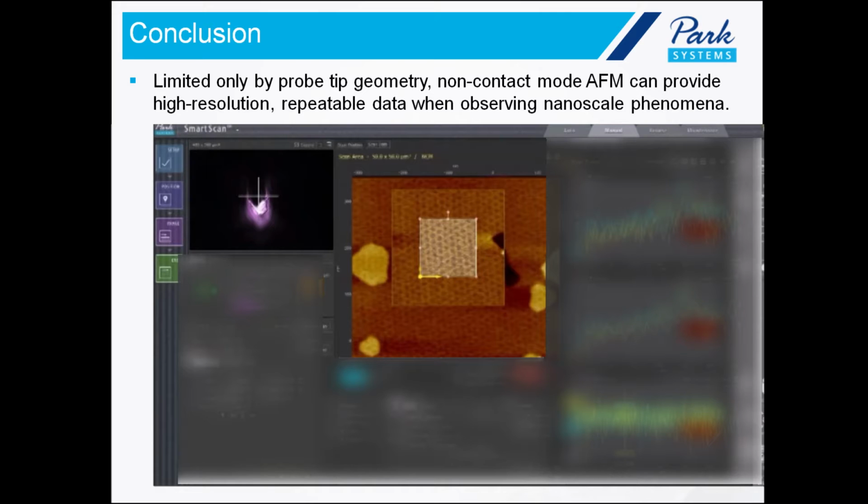So there is a way to tell the software, hey, go ahead and go as slow as you want. And if the slowest speed that the auto mode automatically determines for itself is still not good enough for you, the good thing is we still have a manual mode in this scan control software. So if you wanted to dictate a completely user-defined scan rate, you still can do that.